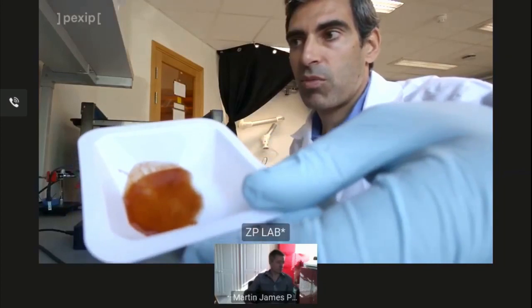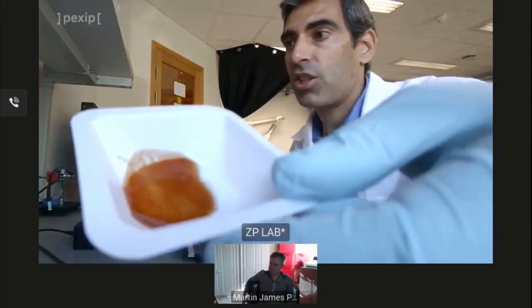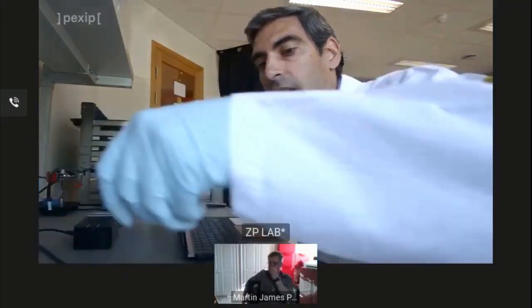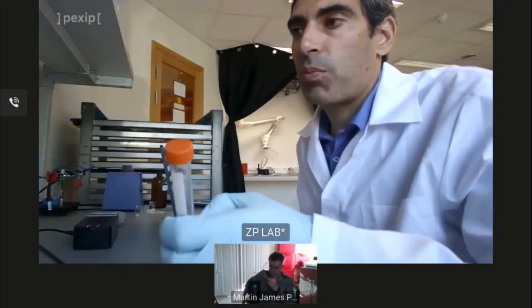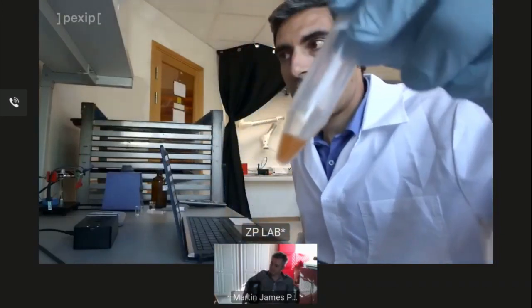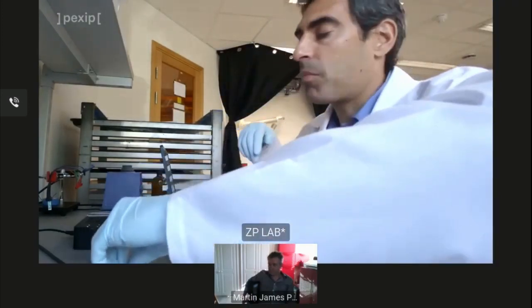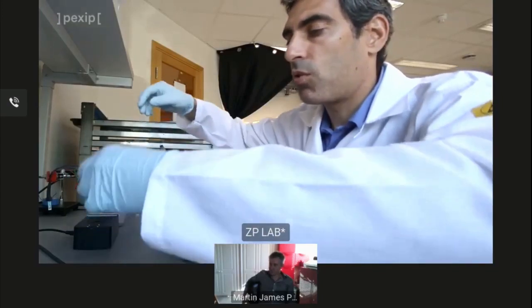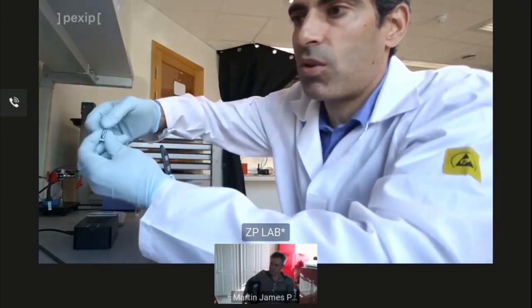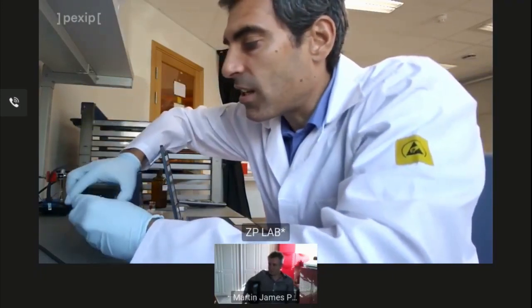So what I did was I poured some Tabasco sauce into some sort of petri dish, weighing dish, and then I mixed it in a proportion of 1:4. I vortexed it and mixed it in this centrifuge tube. Now I mixed it using this vortex for 2 minutes, and now I'm going to insert one of our ZP chili sensors inside the anapod.